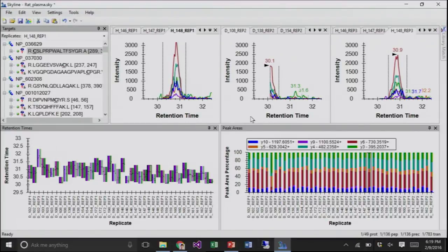What's the concern here? So I integrate that peak. Do you have any concern about that? What about the statistics? If I do statistics and I use that peak area, is that a valid peak area? No, it's not a valid peak area because it's not a full peak area. What if I had an internal reference standard? Would it be a valid peak area?